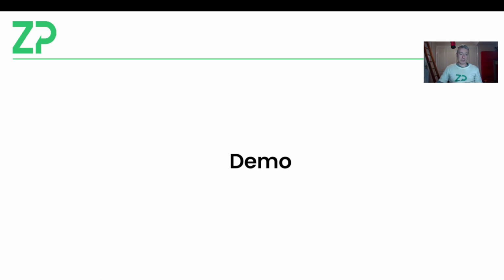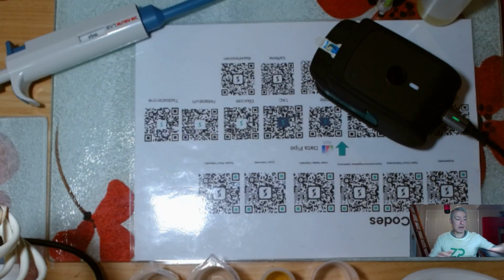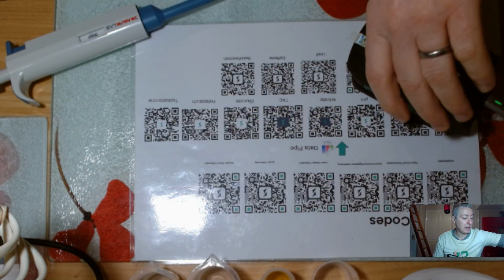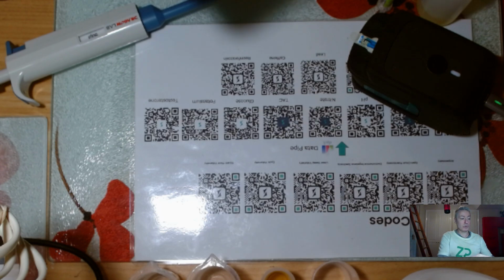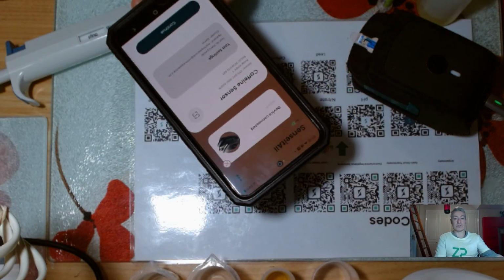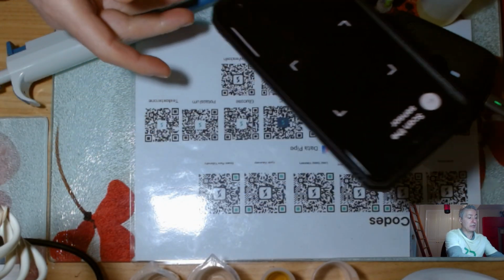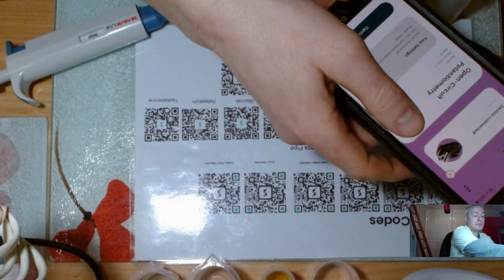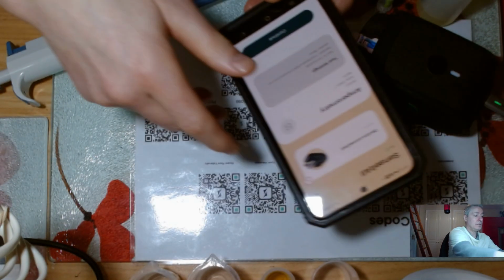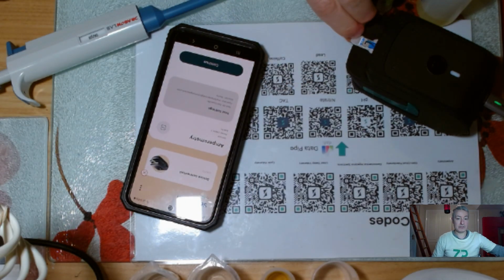So I'm just going to do a quick demo for you, in fact. This is a very powerful platform. Earlier on, I did some cyclic voltammetry. It's also a platform that allows people to develop new assays. So, for example, here's one for caffeine, but I'm going to do a bit more of a fundamental assay here. I'm actually going to use amperometry. So now I'm in amperometry mode. I'm just going to take off that electrode.